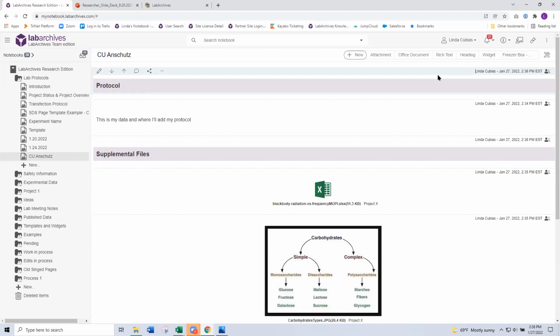So I have a question that's come up about the use of touch screens. So if you were to bring up, let's say, LabArchives on an iPad, for example. We've made some changes to our mobile devices where we actually don't have a physical mobile app that you download anymore. Technically, our iOS one is still in the Apple Store, but we've moved to what we call a progressive web app, meaning if you have a mobile device and you want to bring this up on that mobile device, it's all browser based.